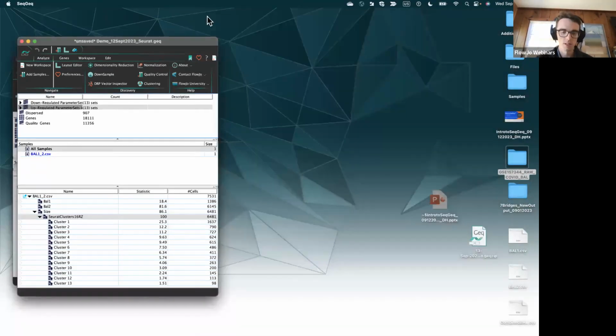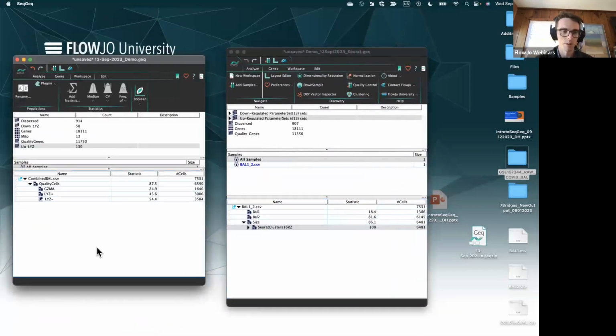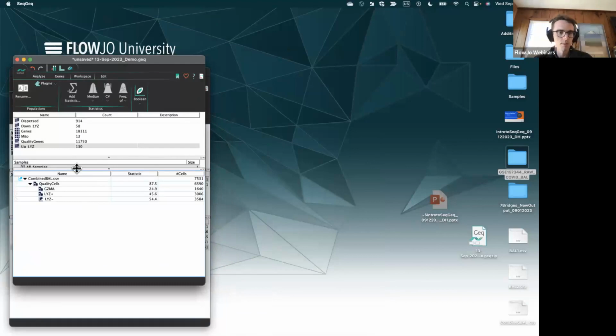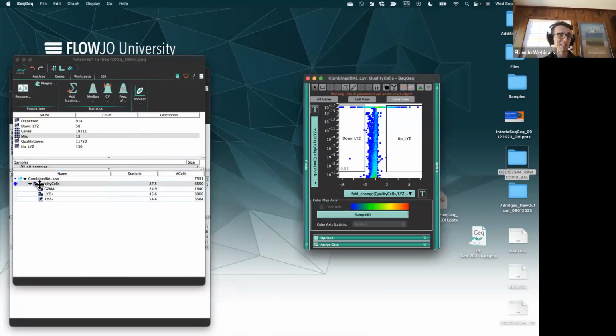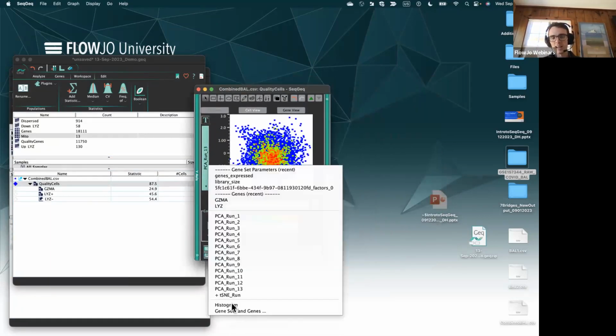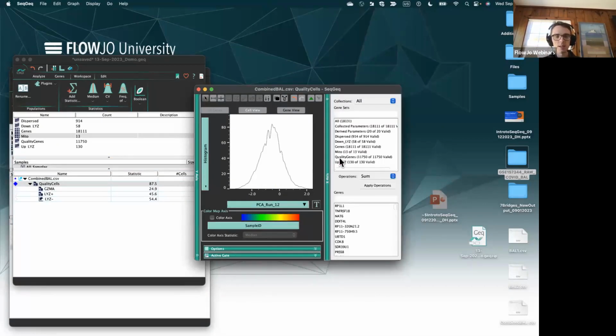And then another thing just to show. Going back to that original analysis we were working with, I made a mitochondrial gene set. I might just flip back to that since it's the one we're familiar with. You might be wondering what we can do with that, and the answer is we can use it to try to identify some dying cells. If we go to cell view, I would set your y-axis to a histogram. Then for the x-axis, open up the x-axis wing here, and I can click on that mitochondrial gene set.